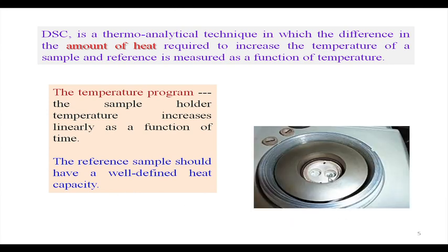So, as we have seen just now, you have R within a cavity and S also within a cavity. So, if everything is now enclosed, this is the corresponding furnace, and that furnace can have the corresponding heating capacity for heating both the two things together. So, this is the most important and useful one, the corresponding chamber for that, and this is the typical instrument, how the DSC instrument looks like.